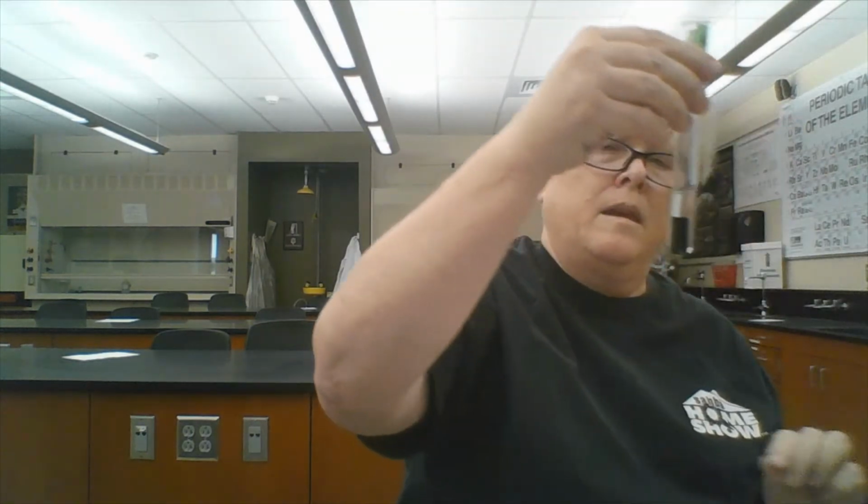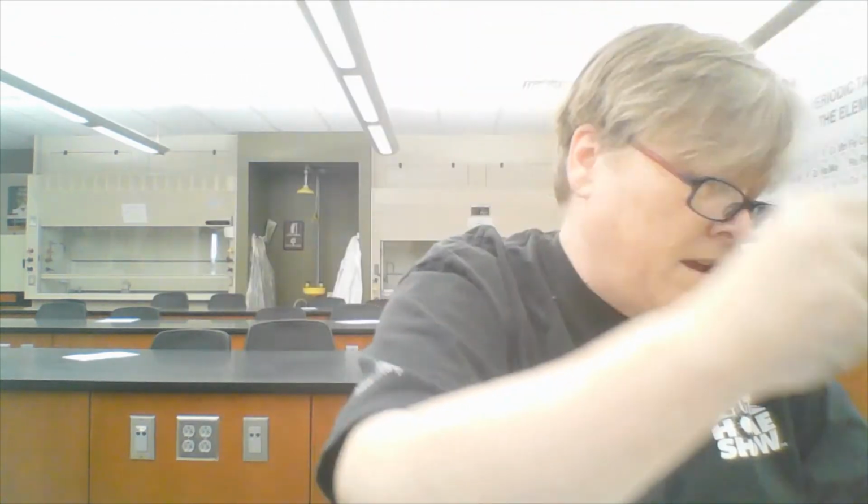I'm going to add a little more silver nitrate to make sure I have enough in there. You can clearly see that lead strip turned black almost immediately. I would say that there is a definite reaction there.